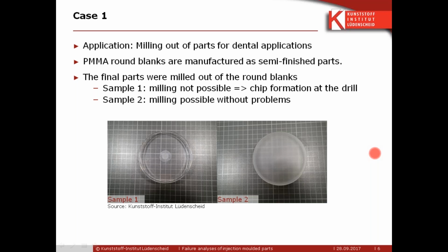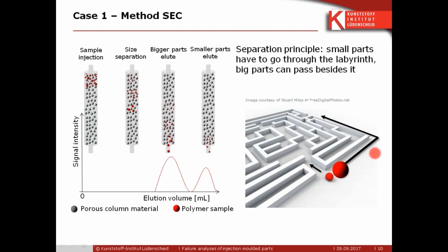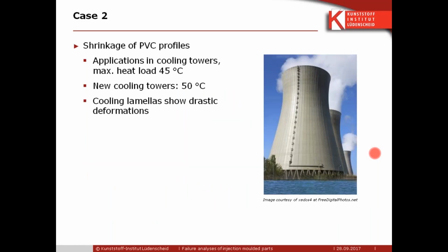I have this question as well. So as the person asks, what is the exotherm? It's actually not exotherm, but it's endotherm. We see endo is up. So the glass transition in Germany is upwards. It's quite common to use endo up. I know in USA it's more common to use endo down. But it's an endothermal peak.